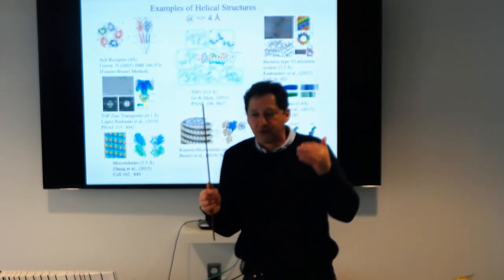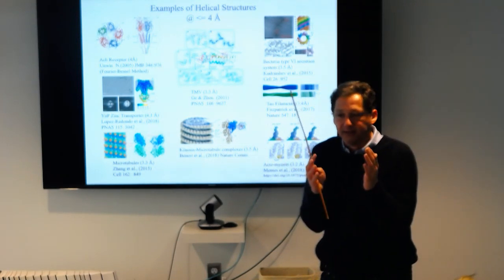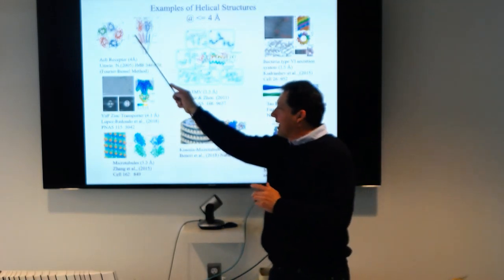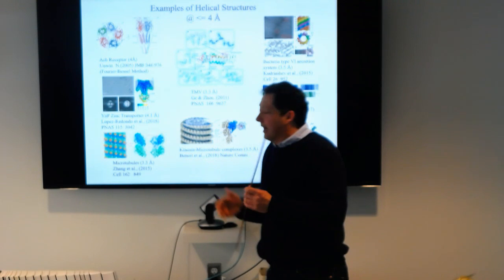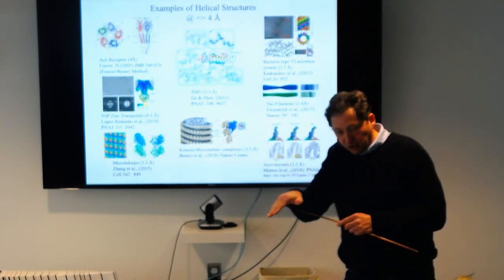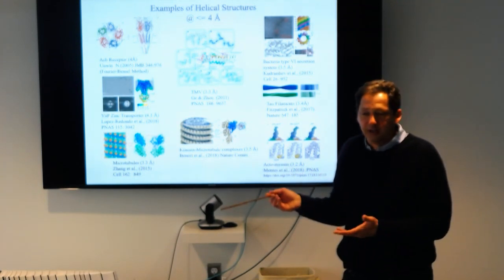They have a lot of corrections in that to correct for different filament diameters and all types of disorder, which they incorporate here to get to that resolution. And at least in my experience, it's a lot easier to incorporate those corrections in real space, which is basically what all the programs do.